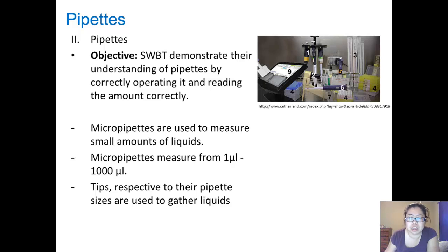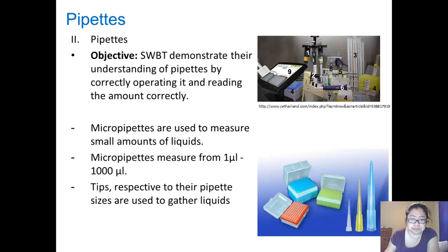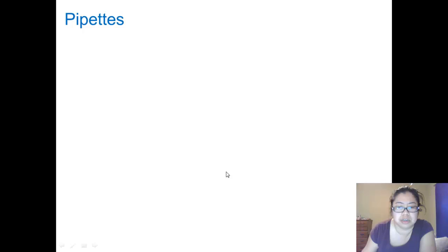And here is a myriad of equipment that can be used. And here are examples of the three different kinds of pipettes: a 20 microliter pipette, a 200 microliter pipette, and a 1,000 microliter pipette.